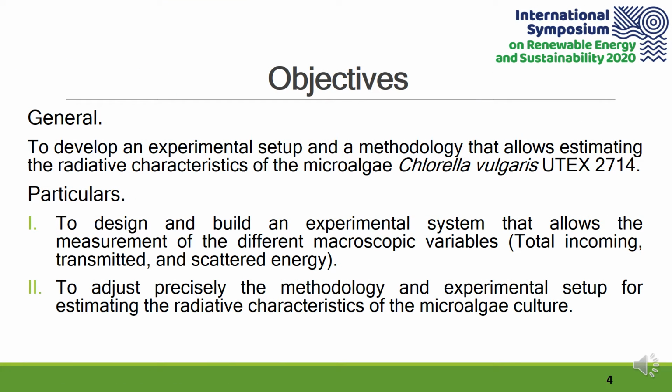The objectives of the project are the following. General: to develop an experimental setup and a methodology that allows estimating the radiative characteristics of the microalgae Chlorella vulgaris UTEX 2714. Particulars: to design and build an experimental system that allows the measurement of the different macroscopic variables, total incoming, transmitted, and scatter energy. To adjust precisely the methodology and experimental setup for estimating the radiative characteristics of the microalgae culture.